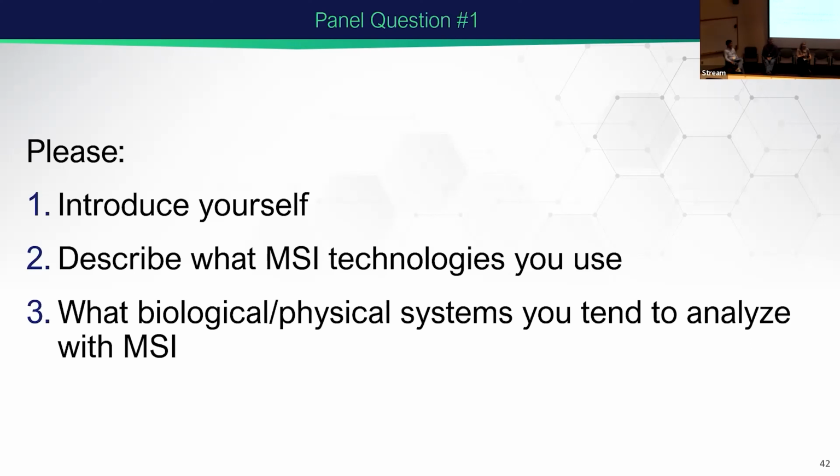Fantastic. And do you think you can briefly mention what you've actually used mass spectrometry imaging for? I know you've done some very fun things with fungal gardens. So actually, back in 2003, when I was choosing what lab to do my PhD research with, I learned about imaging mass spectrometry. So I specifically chose to go to the professor's lab that developed MALDI imaging mass spectrometry. And I think the power of it is, if you think of those pictures that they showed with the images, those are micron-sized tissues, and you saw all the diversity that's in there.